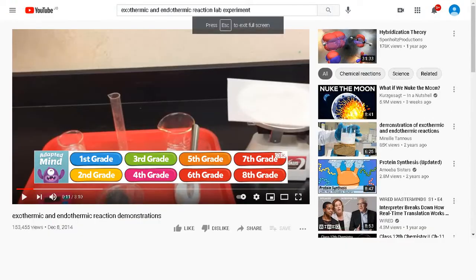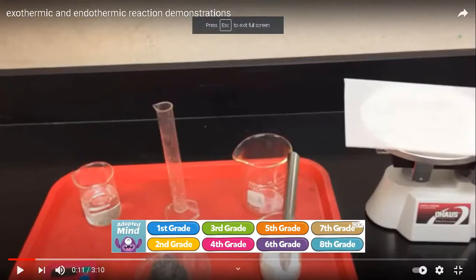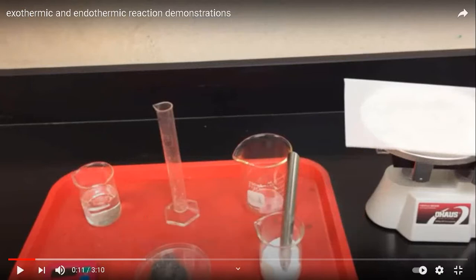Hello everyone. In this video we're going to see a lab experiment to understand the difference between the exothermic and endothermic reaction. Just to remind you, exothermic reactions produce energy and endothermic reactions take energy from the environment. I want you to look carefully at this experiment.